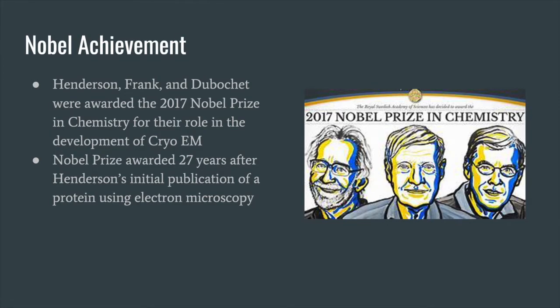Henderson, Frank, and Dubochet, who were mentioned previously in this presentation, were awarded the 2017 Nobel Prize in Chemistry for their role in the development of cryo-EM, which really shows how important this technology is. This was awarded 27 years after Henderson's initial publication of a protein using electron microscopy.